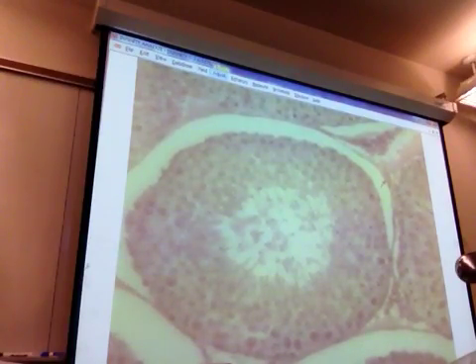Spermatids. But see all these nuclei up here that are tiny and kind of elongated? Even though you can't see the tails, some of them look kind of long, but then some of them are kind of small, and you can't always see the tails attached, but you can definitely see the cytoplasm. Those would be the spermatids. So that would be a nuclei, that would be a nuclei, that would be a nuclei, for example.